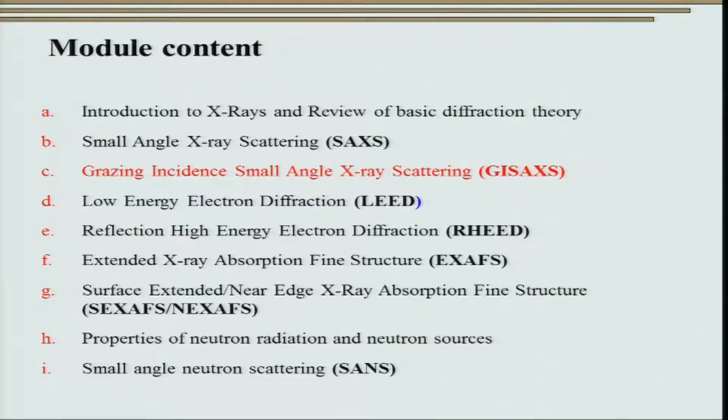We also know that with the increase in research going on in nanotechnology, there is a lot of need for a characterization technique that can be used to characterize small scale sizes and shapes on the surface, right? And for that, we need to use a technique which is essentially known as grazing incidence small angle X-ray scattering.